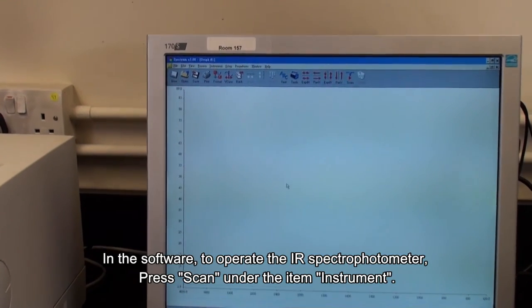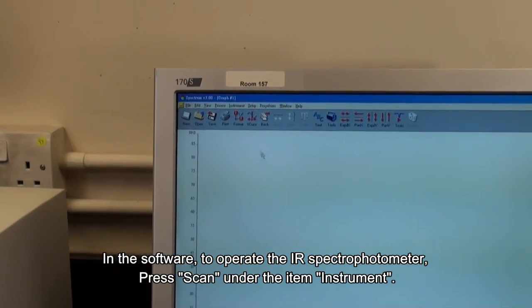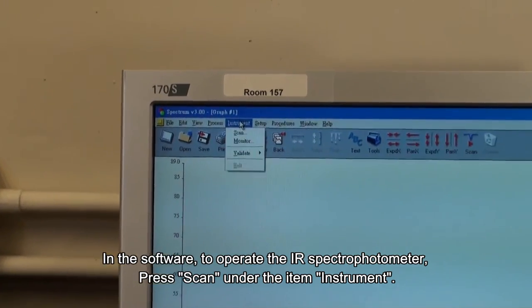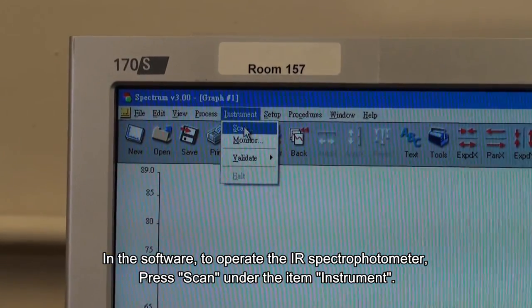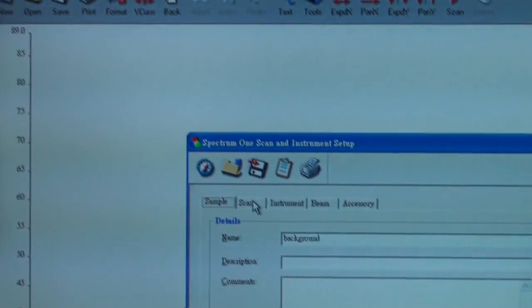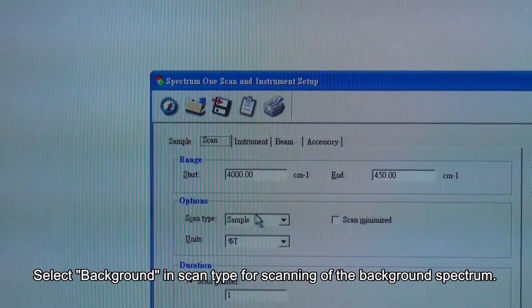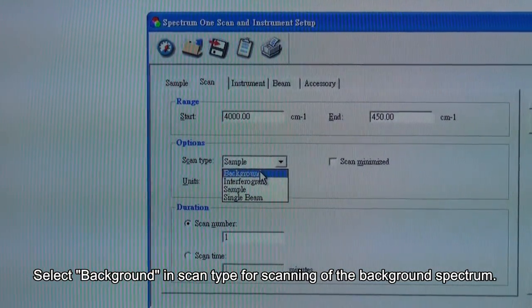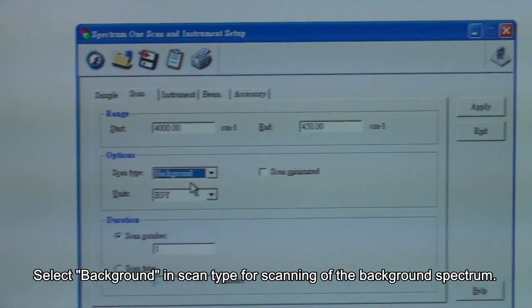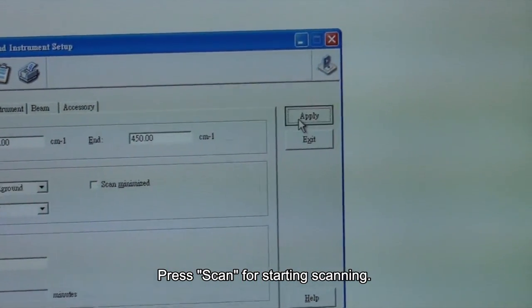In the software to operate the IR spectrophotometer, press scan under the item instrument. Select background in scan type for scanning of the background spectrum. Press scan for starting scanning.